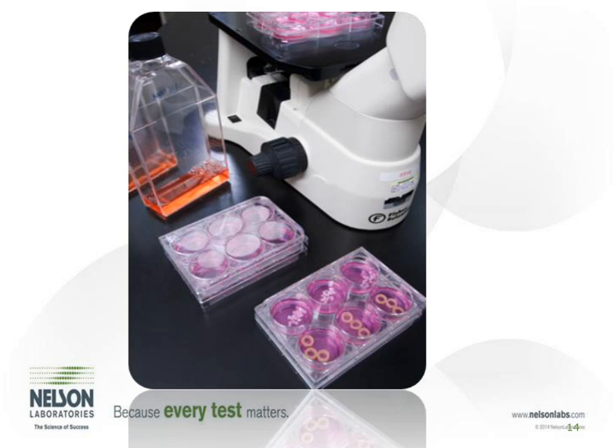And so in the flask there, you see some of that cell culture media. It's kind of a pinkish-reddish color. It has a phenol red indicator in it. So if the pH of the extract gets too low, it will turn yellow. If it gets too high, it will start to turn purple. So it can vary a little bit in color, but that's our extraction media.